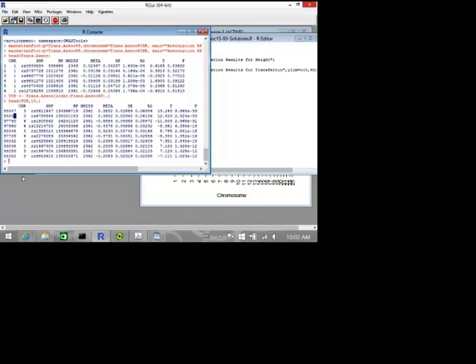If you wanted to look at the LD, you just create a text file with just the SNP names. You can extract it in R, tell R to give me the top SNP column, and then you can print that out to a file as well.